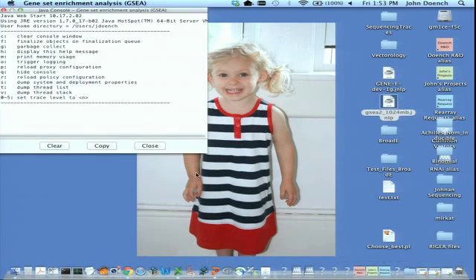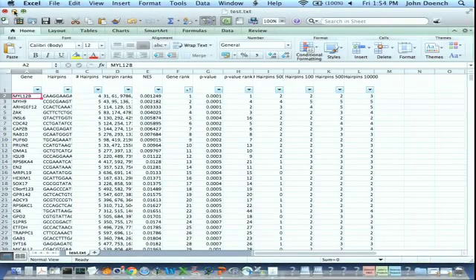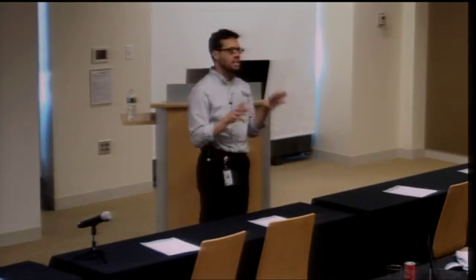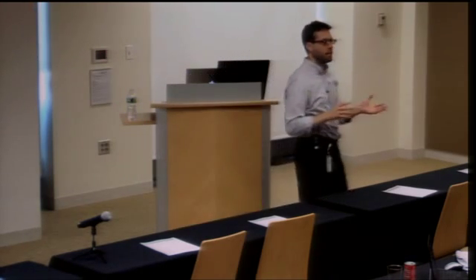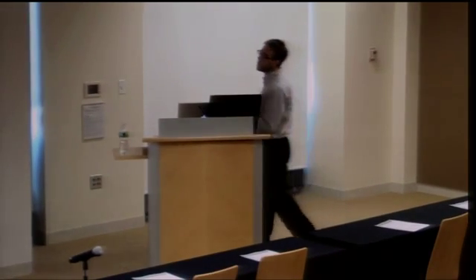Okay, so we launched GSEA. Good. GSEA was designed and is still most heavily used for analyzing expression signatures. So you generate an expression signature from your cells, perturbation, or whatever of interest, and you run an Affymetrix array. And then you want to compare the output of that array to some pre-existing microarray data. That's what it was originally designed for. So using GSEA for gene lists requires a bit of a hack. I mean, a supported hack, but a bit of a hack from what GSEA was originally designed to do.